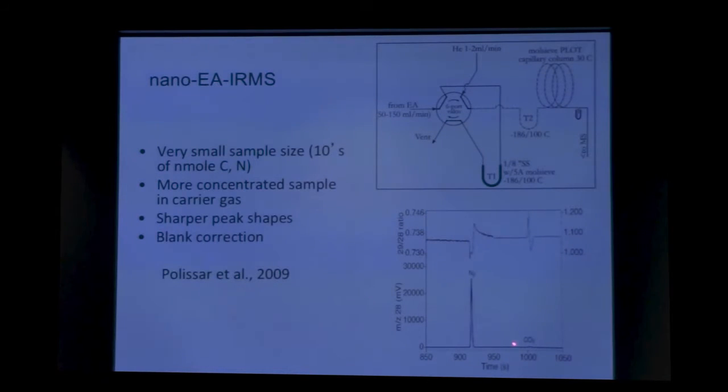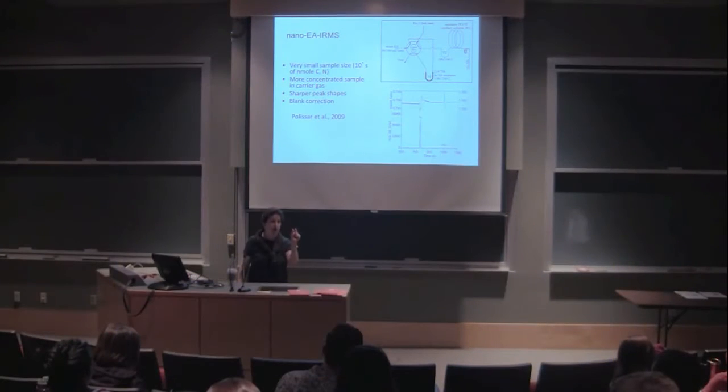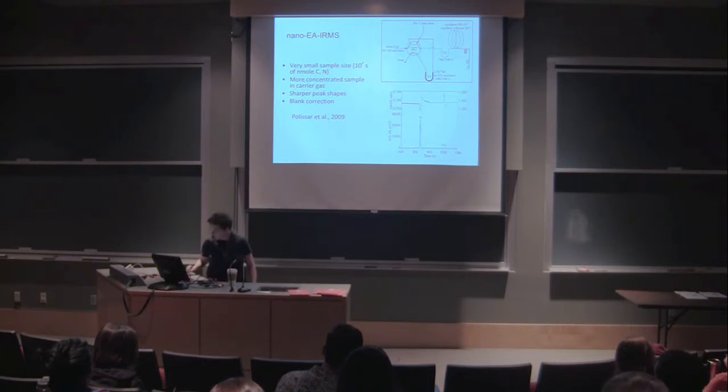So this is about five or eight seconds wide in peak. So that's our EA peak. And this little chromatogram is the mass of 28, so we can see the N2 very nicely. CO2 also makes an ion at mass 28. It's smaller. And so just for illustration purposes of the timing, we're monitoring that one mass. And so we can measure the ratios and make our isotope measurements of two peaks separated with about 100 seconds of time, and they're eight seconds wide. So that's a really nice separation power. And we're currently partnering with Thermo on incorporating this design into their commercial product because the trend in the field has now swung back the other way, and people want to run small samples.